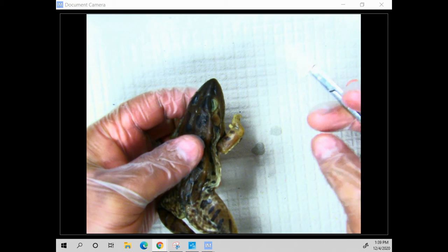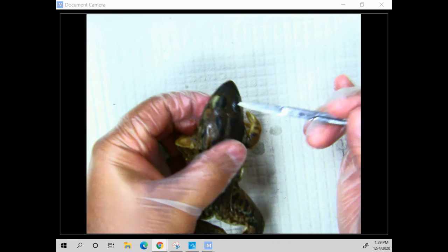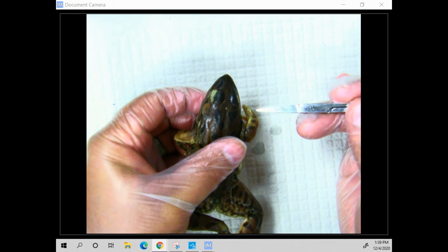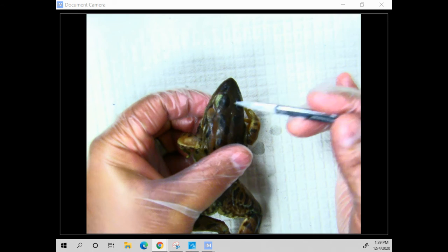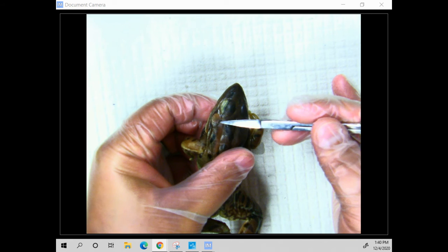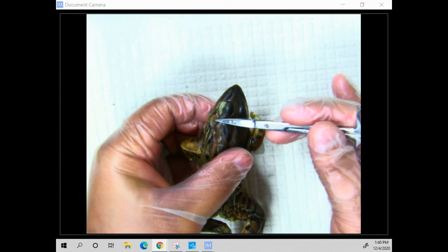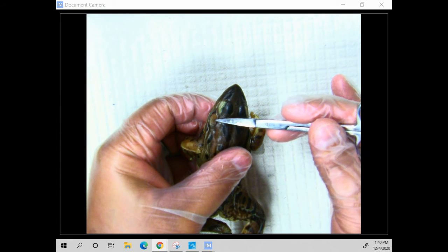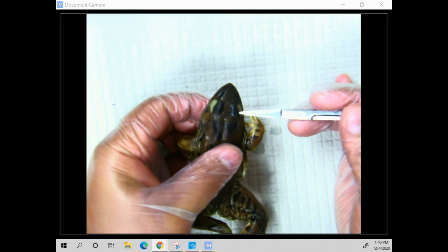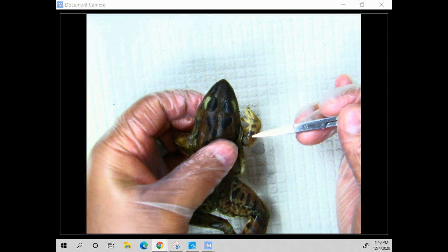These are called the tympanum, and that is their eardrums. The tympanum is their eardrums, which translates the sound from the vibrations to the brain. So since this is the tympanum translating vibrations from sound up to the brain, this would be part of what system? Which body system?